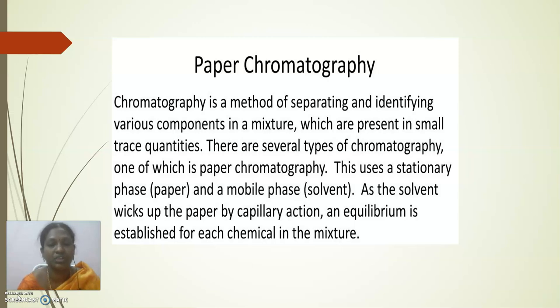This uses the stationary phase, that is the paper. Here the paper acts as the stationary phase, and the mobile phase is the solvent, that is the liquid. It is one of the easiest types of chromatography.